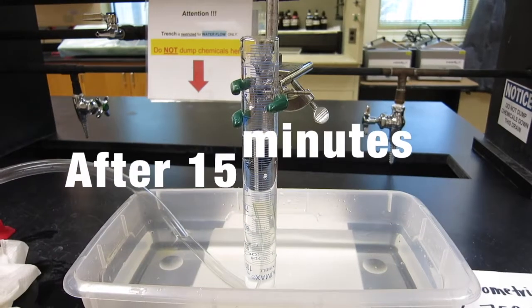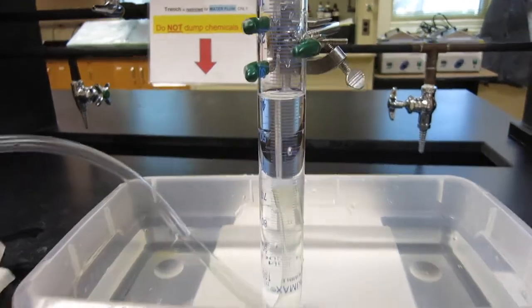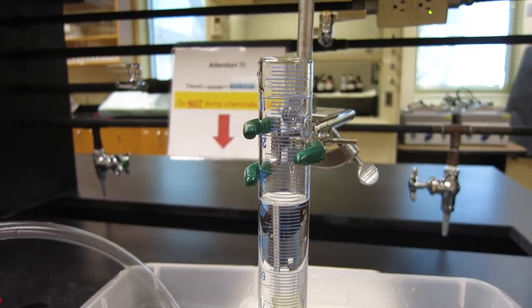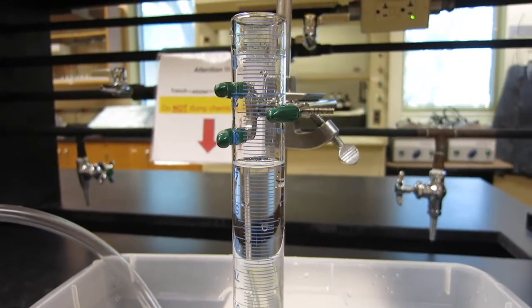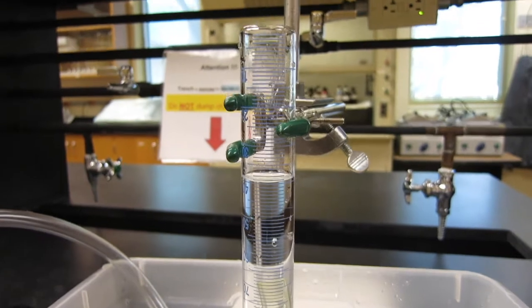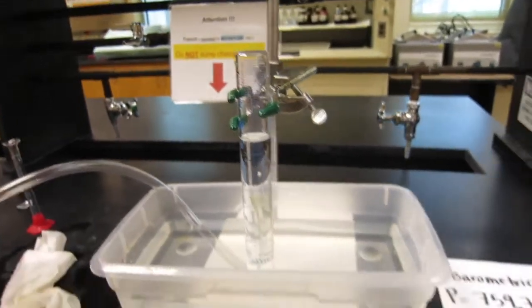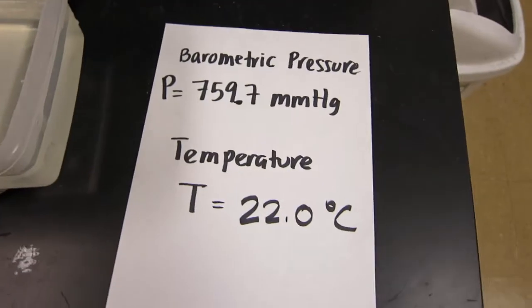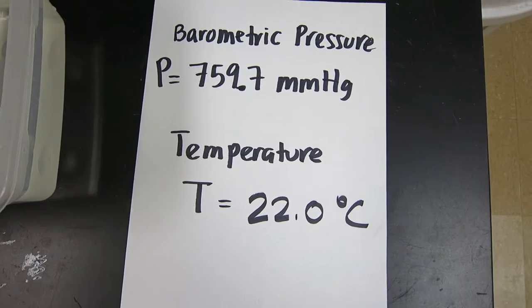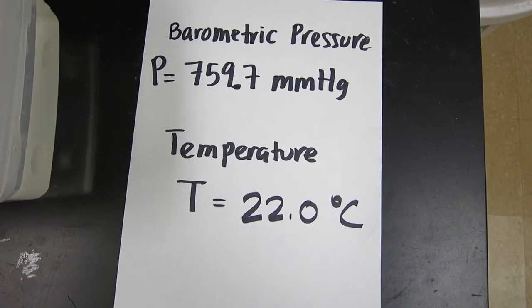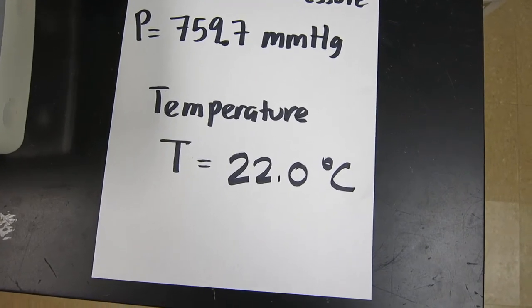So this is at the end of about 10 to 15 minutes, and we're reading that. So it's 40, 40 ml of gas being produced. We also want to let you know the current barometric pressure is 759.7 millimeter mercury, and the temperature in this room is 22.0 degrees Celsius.